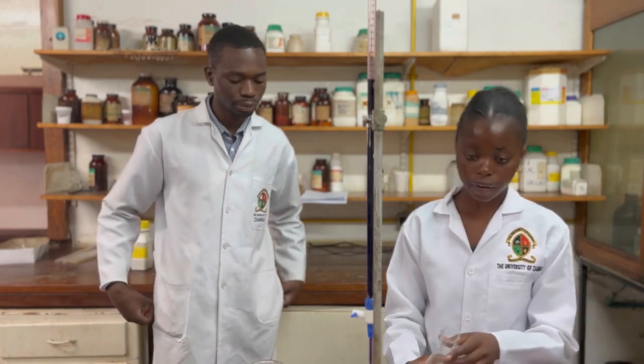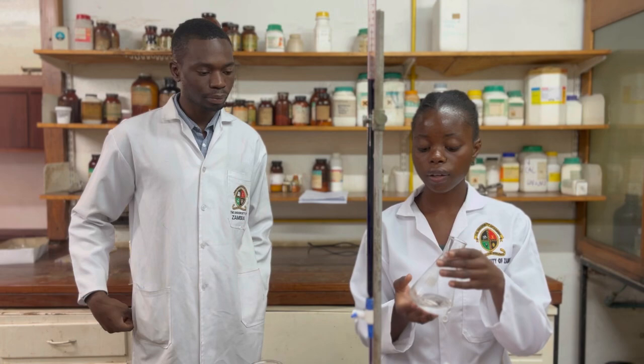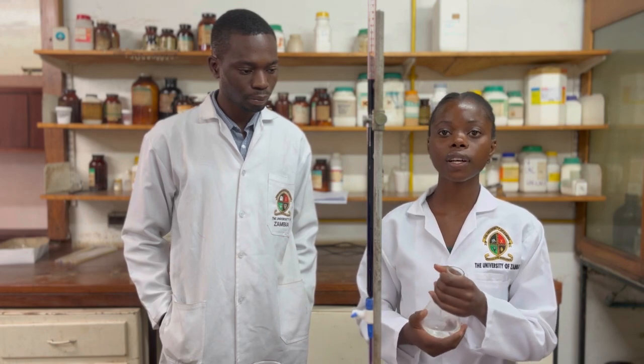Now she's going to clearly explain how you're supposed to mix and what you're supposed to do in this lab session. The first thing we have here in the conical flask is iron(II) sulfate, which is mixed with sulfuric acid. As mentioned earlier, this entire experiment is done under acidic media.